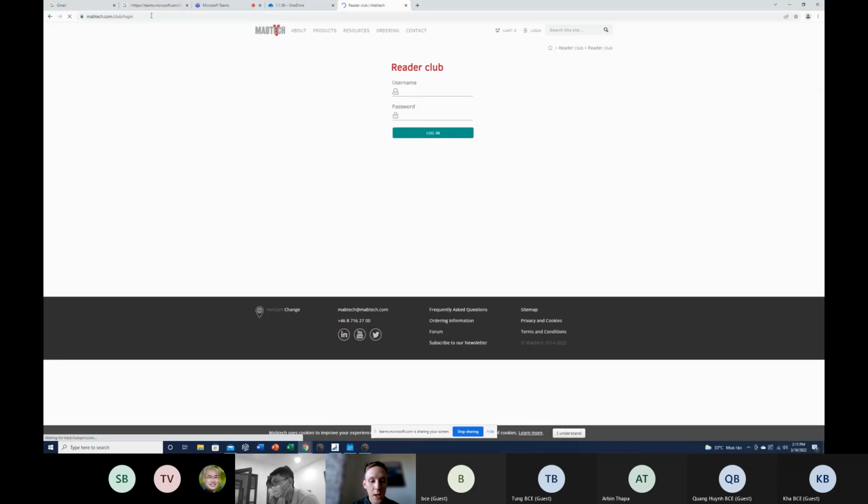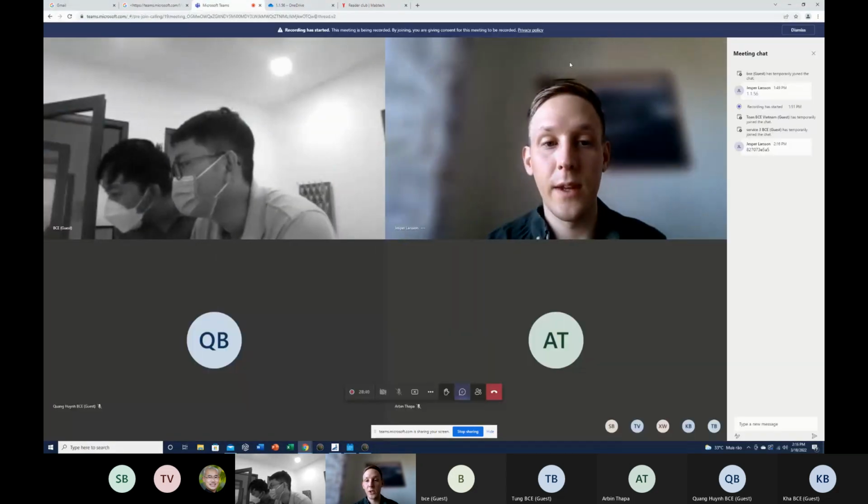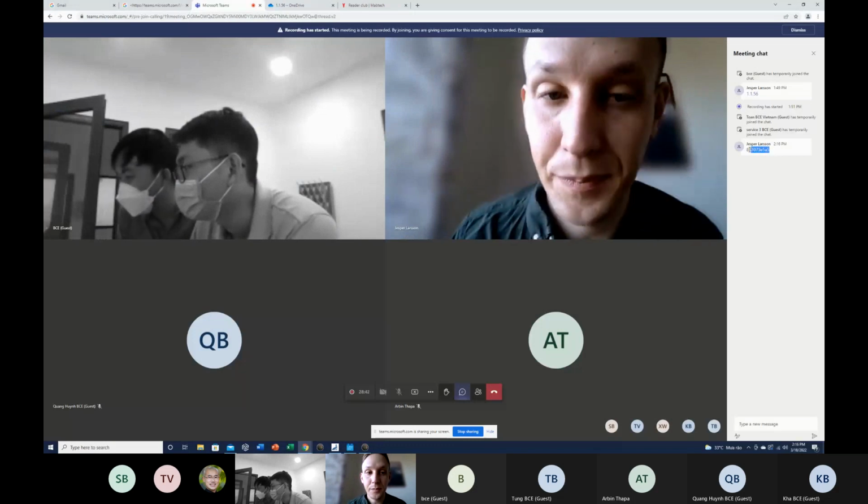Okay. Great. And now you're going to be logged in here. So you can enter the username BCE. And then I'm going to send you the password in the Teams chat. It's not the easiest password. That's why I'm going to send it in the chat. So you're going to get it in the Teams chat.